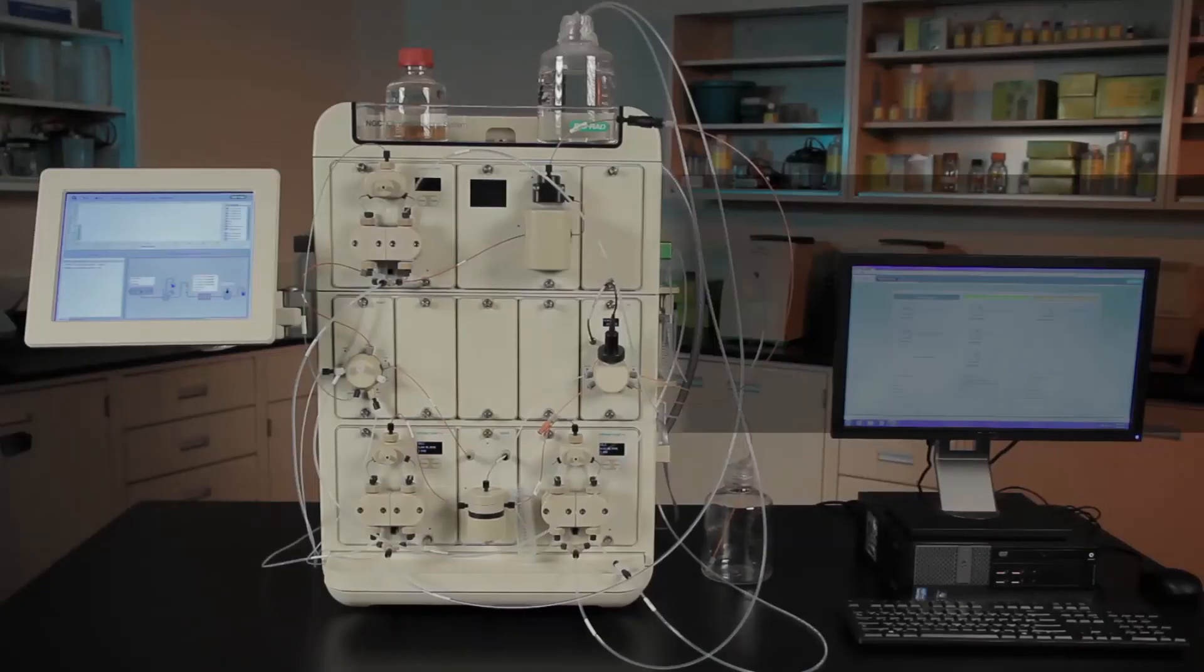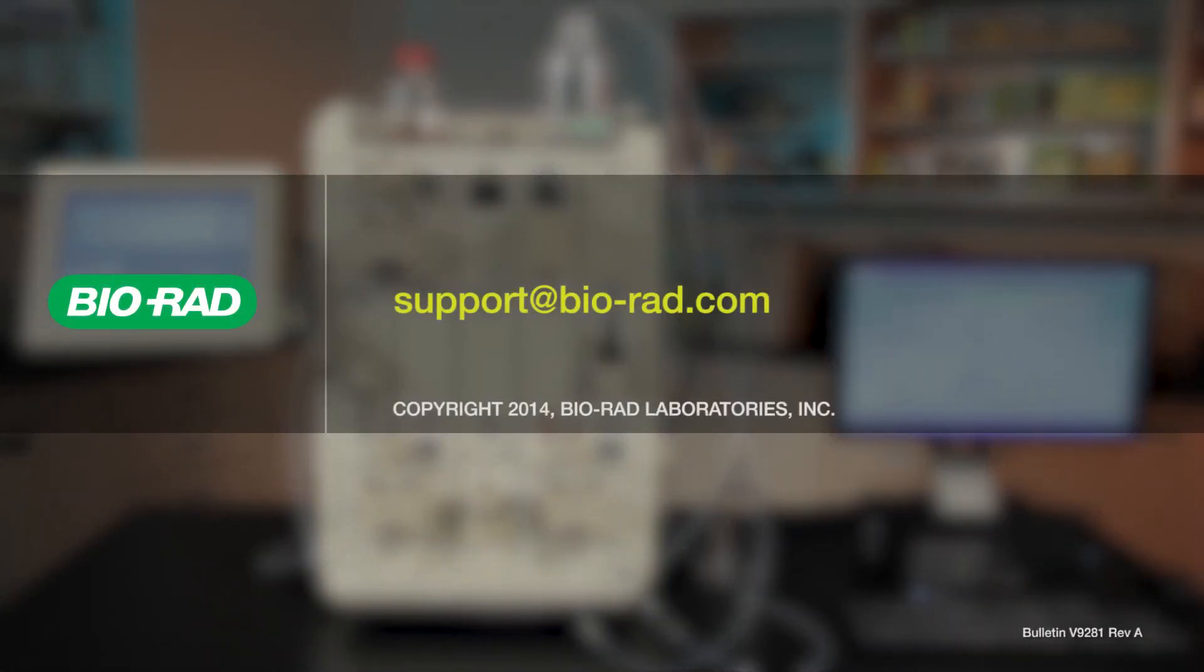Your pH valve module is now calibrated and ready to monitor your buffer pH. As always, if you have questions about any of your BioRad products, please don't hesitate to contact us at support at BioRad.com.